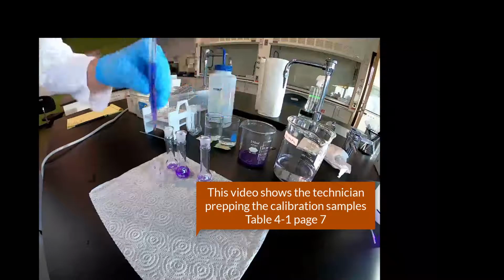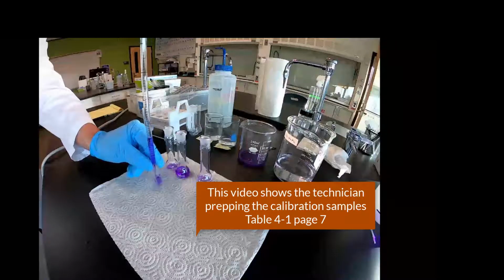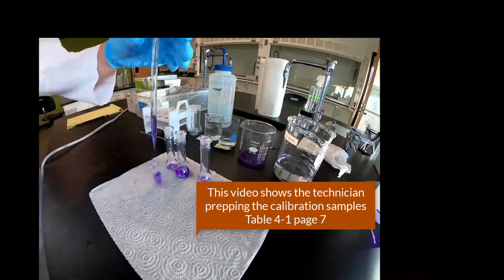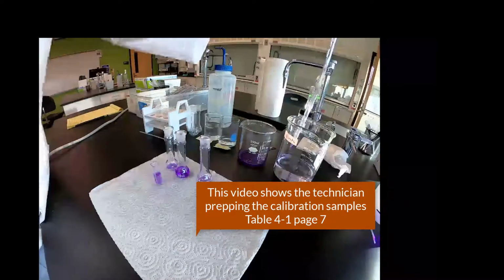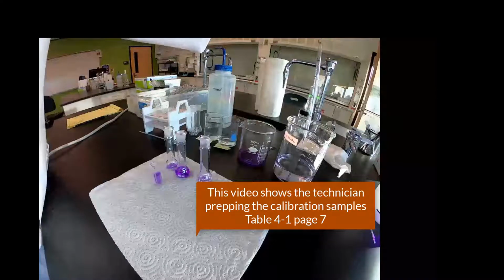And he's very carefully measuring the amount to put in there, but you can just get it roughly across that halfway mark where the volumetric glass is present, and that's all you need. So that's one cuvette down. That's mother solution in that cuvette.